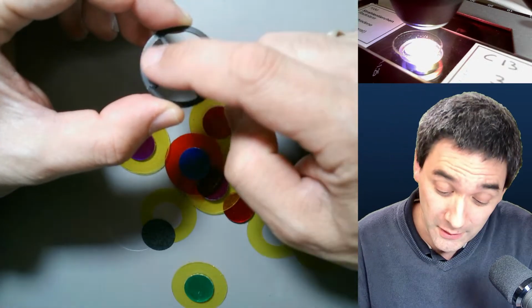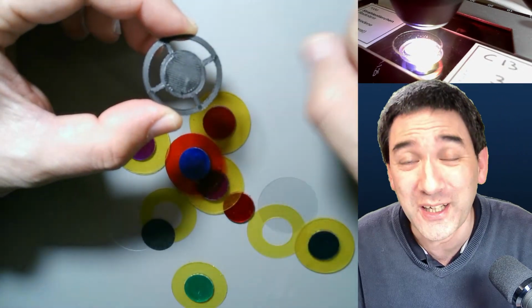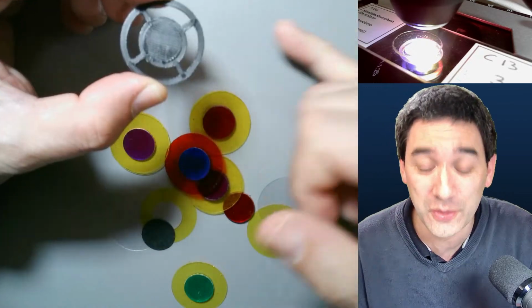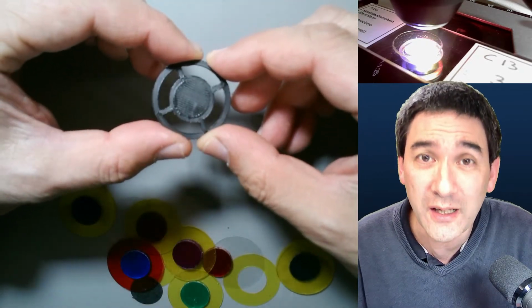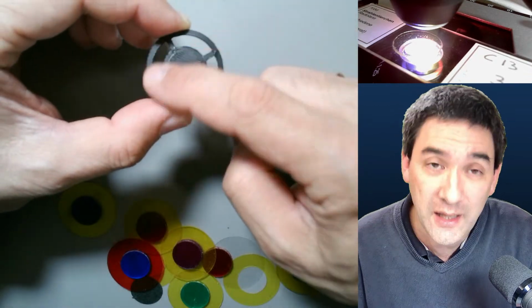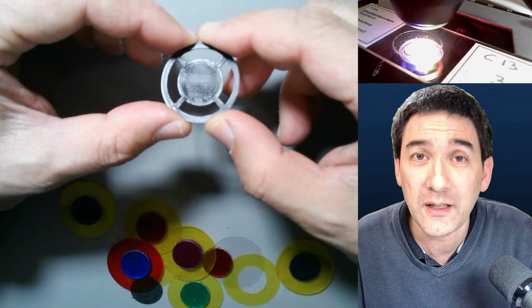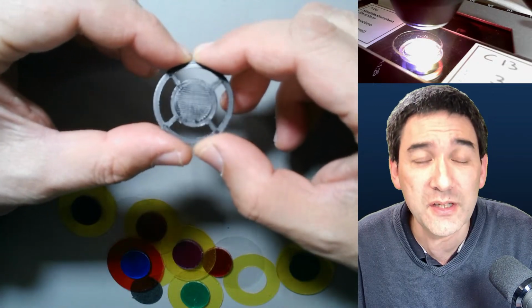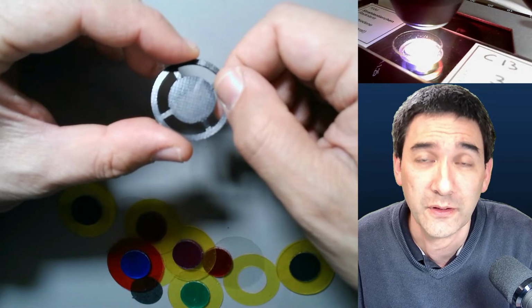But you have to make the disc even wider, otherwise you're not going to get a dark background. So this basically means you have two ways in which you're reducing the light. You're going up with the magnification, and you have to make the central disc larger. This means there is a certain limit which is practically possible with those filters.